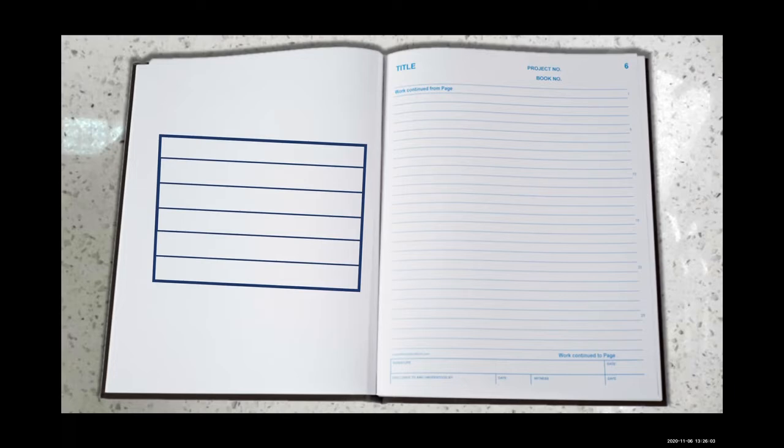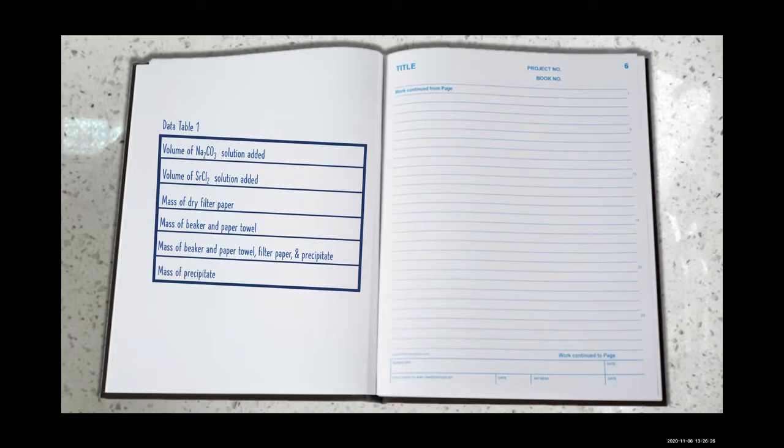Let's begin our data collection by setting up a data table. We will need to know the volume of sodium carbonate solution added, the volume of strontium chloride solution added, the mass of dry filter paper, the mass of a beaker and a paper towel, the mass of a beaker, paper towel, filter paper, and precipitate, and that should allow us to find the mass of the precipitate.